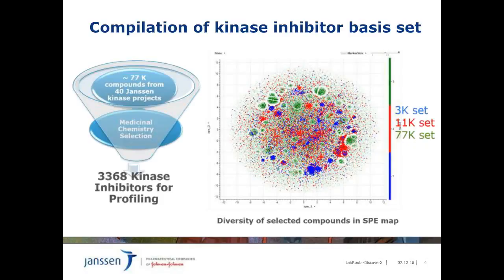The second key question was about the selection of the compounds. Which compounds should we profile? So Janssen has around 77,000 kinase inhibitor compounds which were synthesized within 40 internal kinase projects or from kinase-focused library enhancement projects. A medicinal chemistry guided selection was done for 3,000 compounds, in addition to selections from chemoinformatics-based approaches. Prior to the project, we had profiled around 8,000 compounds in DiscoverX and Millipore assays, so that after the completion of the project, we had broad profiling data for around 11,000 compounds.